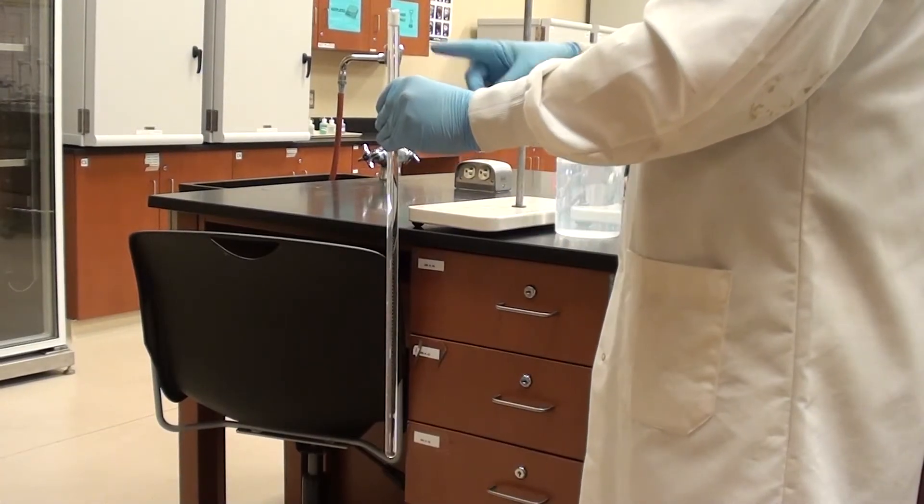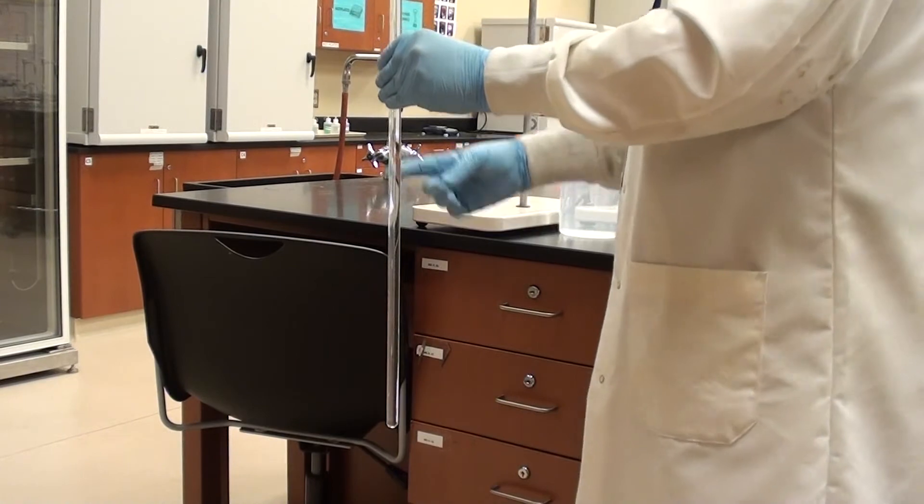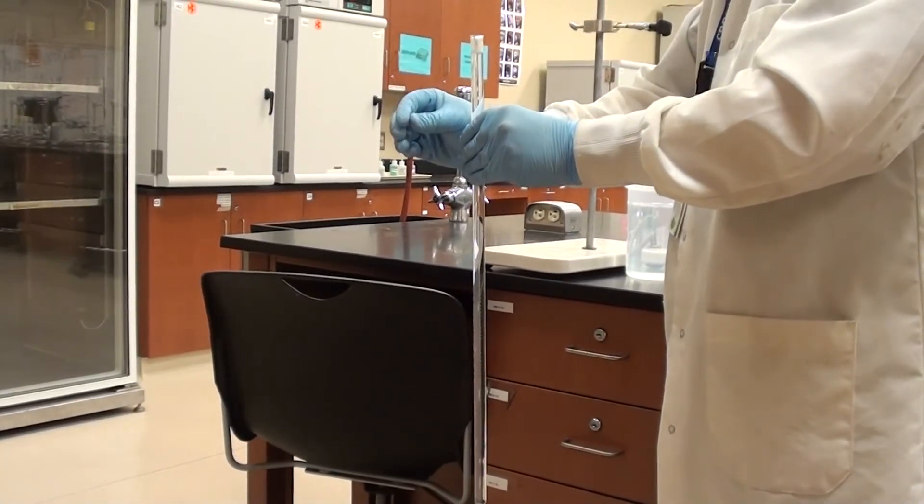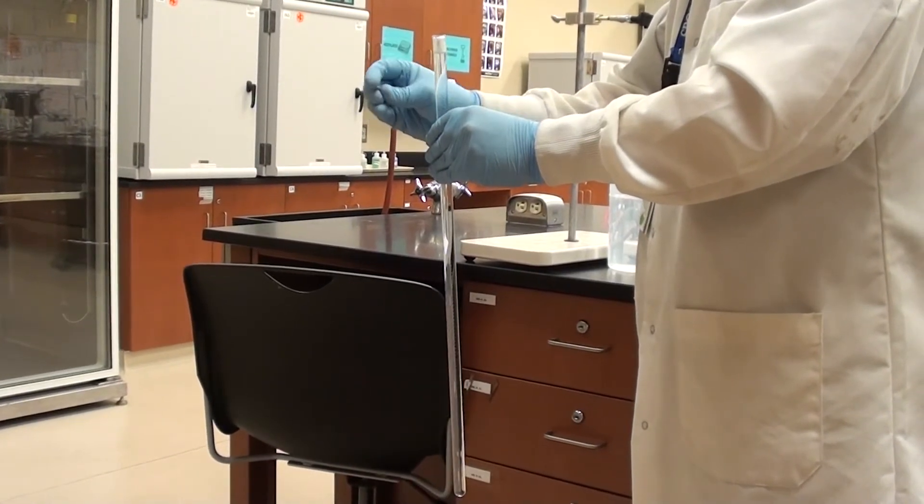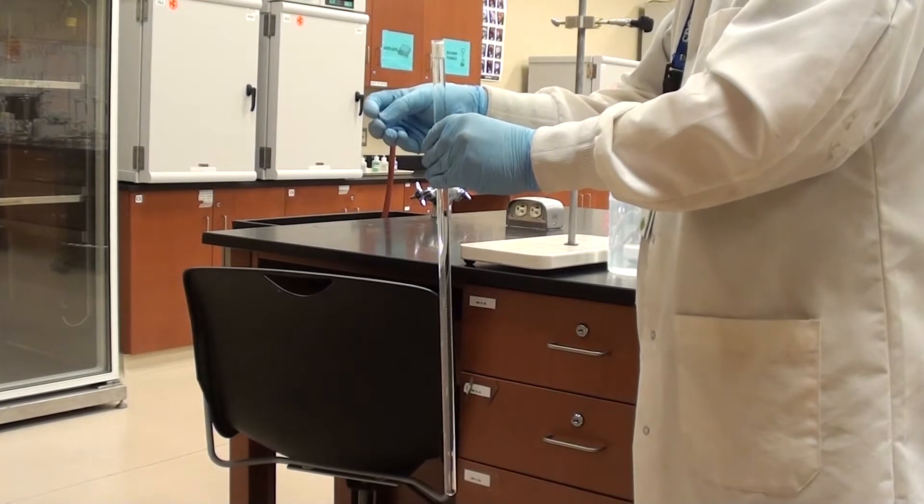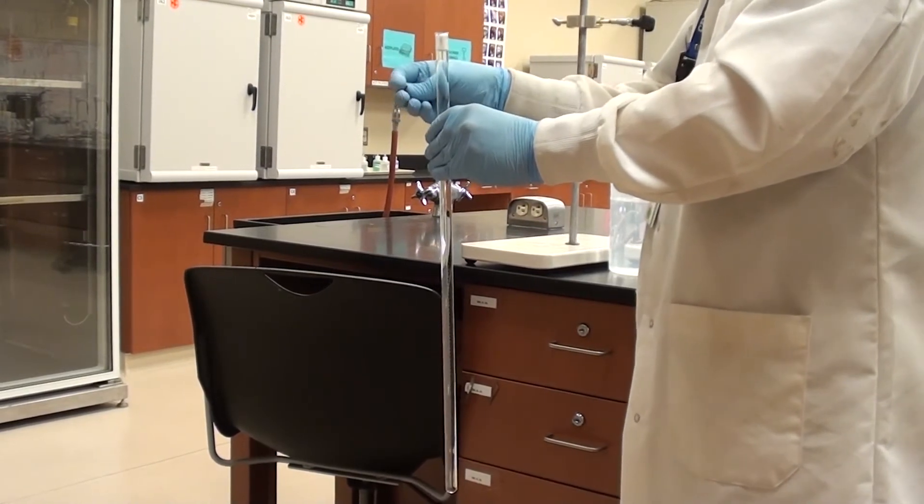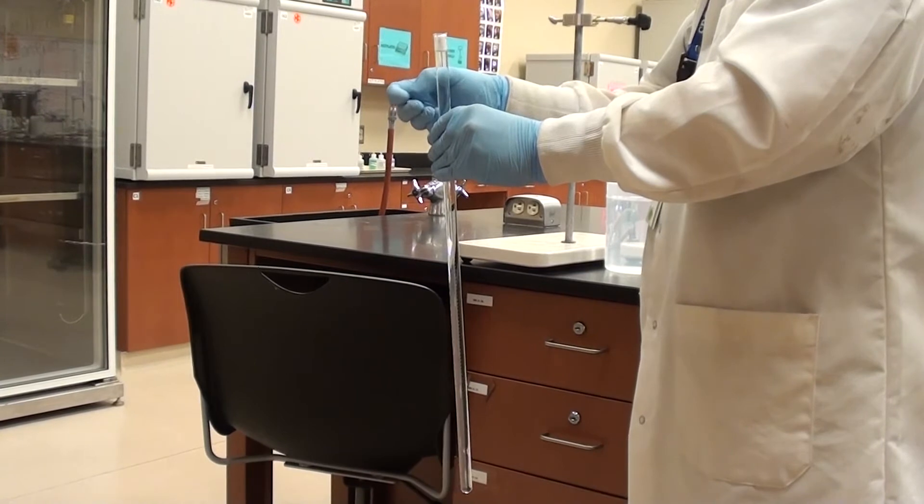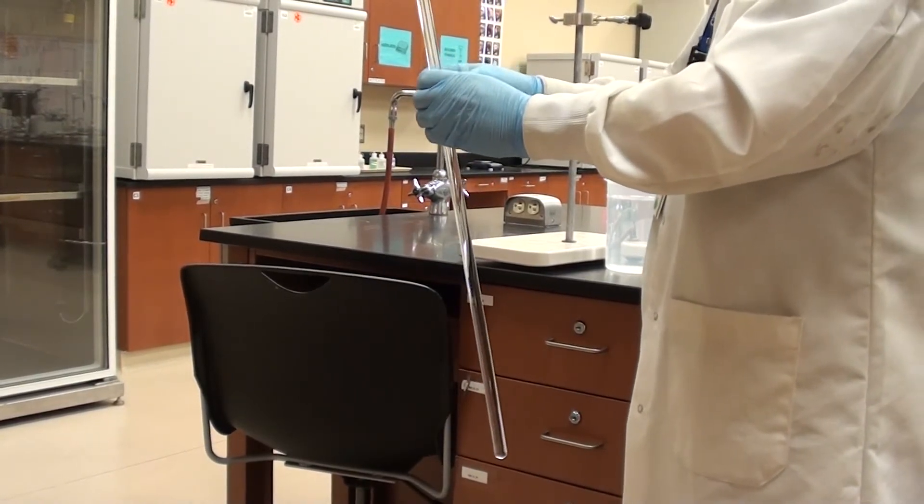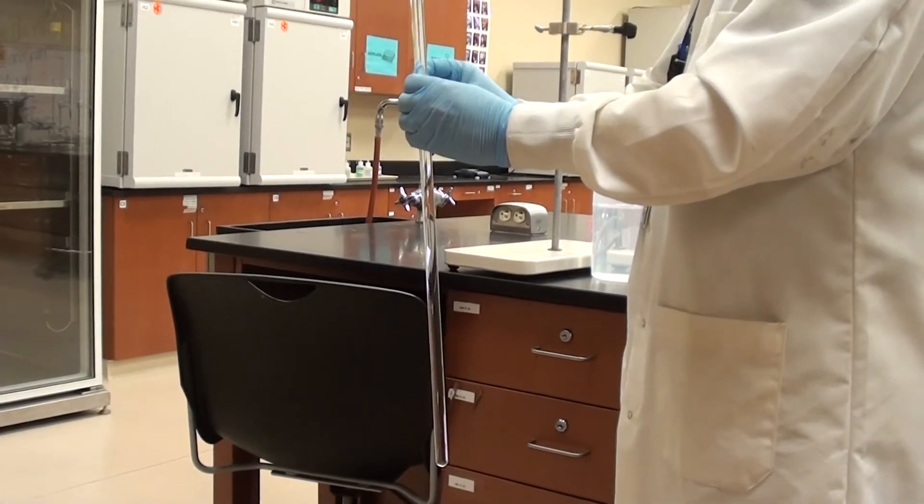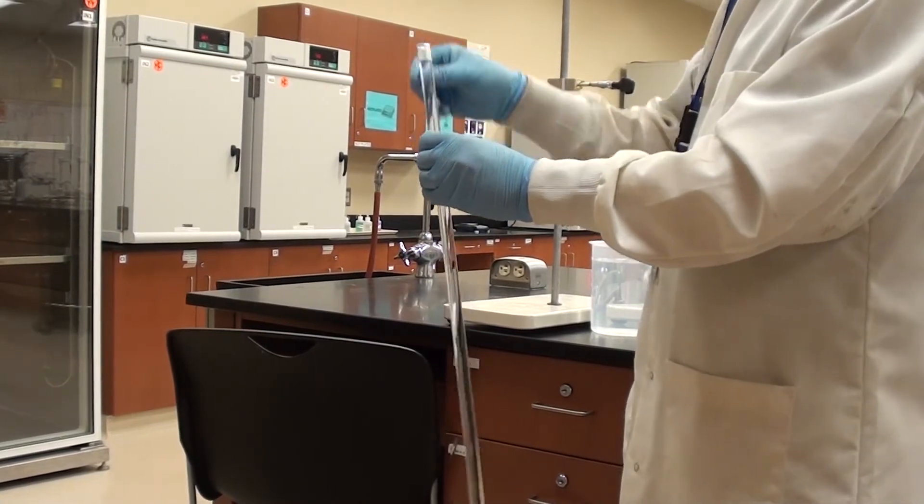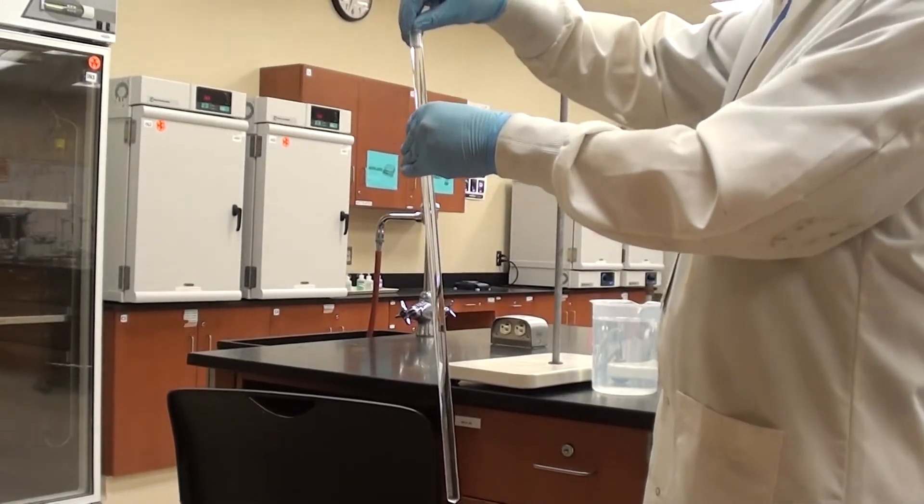So here we've got our eudiometer tube layered with the water on top, the HCl on the bottom. This is the magnesium I cut earlier and I'm going to just sort of screw that up into a very loose ball of sorts. And what I'm going to do is put this into the eudiometer tube. There we go, I'm just getting that into a ball here. Alright.